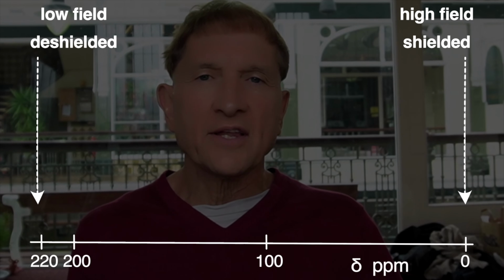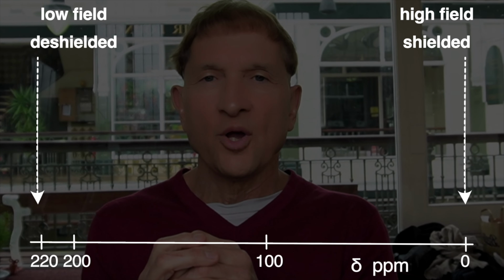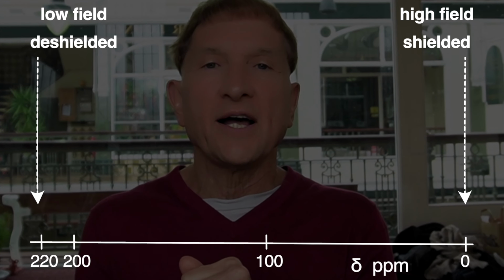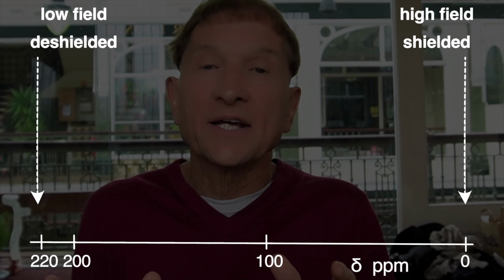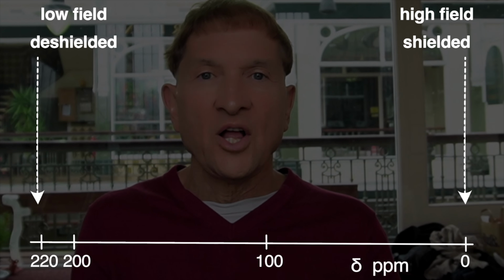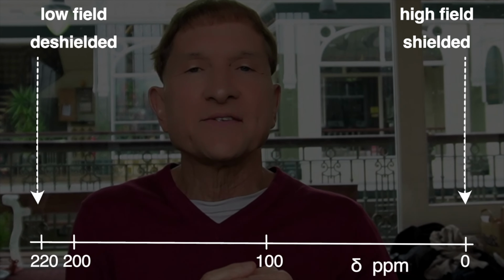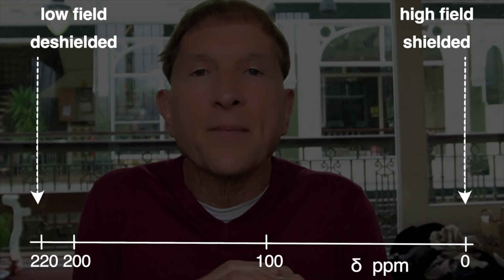Two terms are very important to remember. The region near the left of the NMR spectrum is called downfield or de-shielded. It means that less energy is required to flip nuclei that resonate in that end of the spectrum because they're less shielded by their molecular environments, by the atoms around them. At the right of the spectrum is the shielded high field region. For atoms that resonate there, it takes relatively more magnetism to flip them because their molecular environment is protecting them from the magnetic field more.